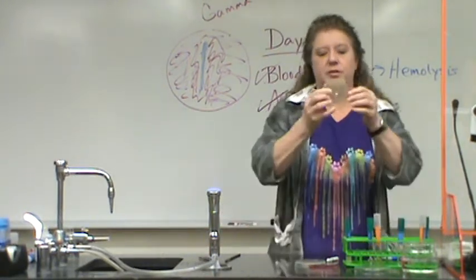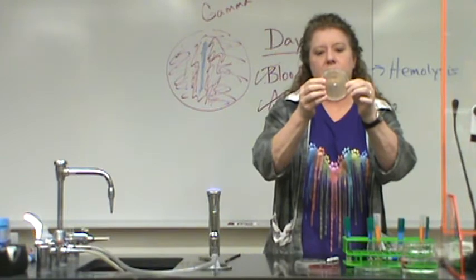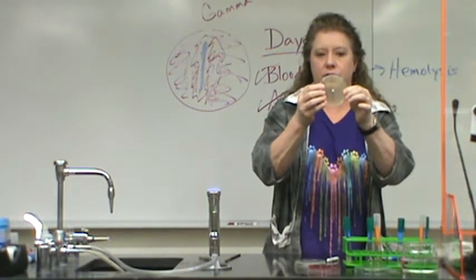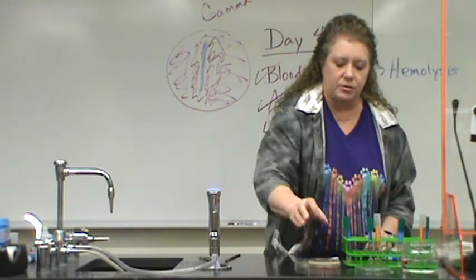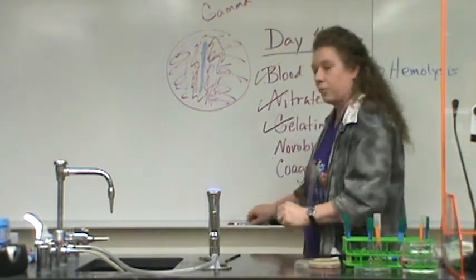Okay, and now you can see that the filter disc is in the middle of the lawn of the unknown bacteria. Okay, so you're doing the Kirby-Bauer method. So that is ready for the incubator as well.